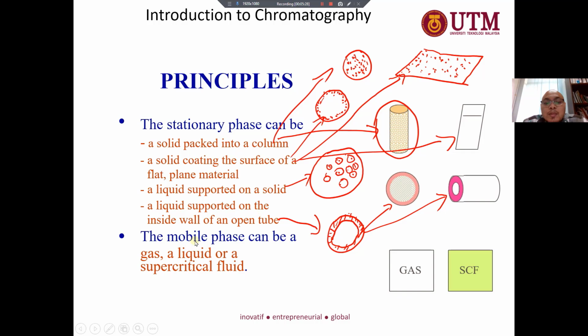Okay, the next one, the mobile phase can be a gas, a liquid or a supercritical fluid. We can have three kinds of mobile phase, but normally we divide into gas and liquid because supercritical fluid also belongs under liquid mobile phase.